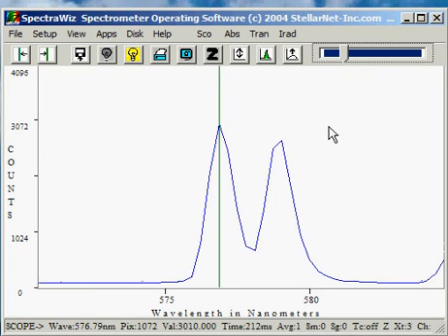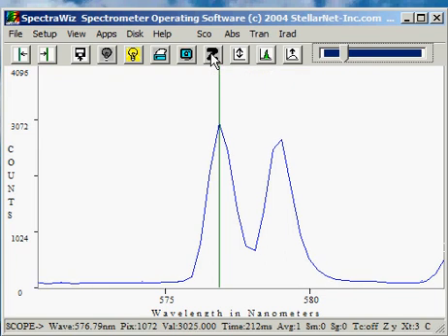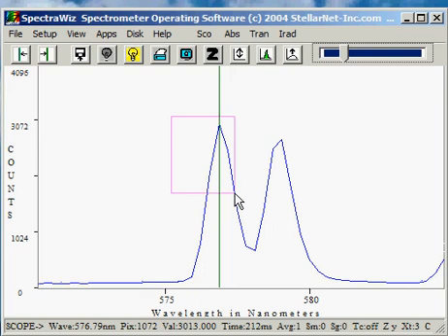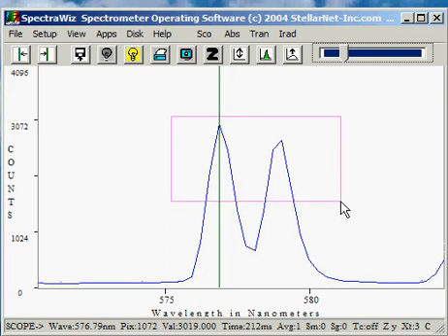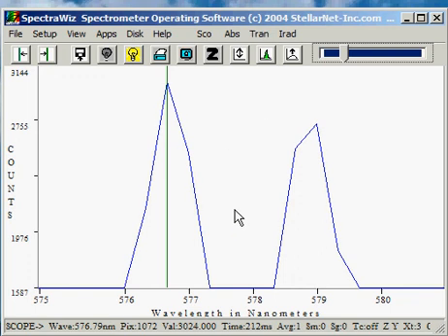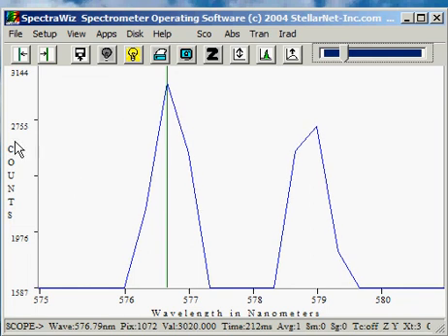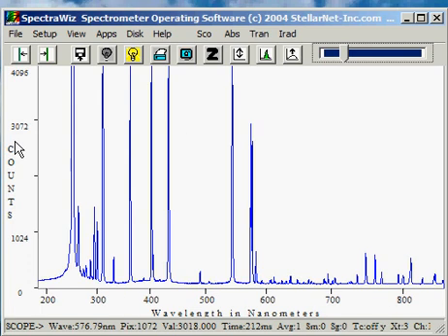Let's have a closer look at the zoom function. If I want to enable the YZoom feature, I right-click on the Z. This allows me to draw a box around the area that I only wish to see. And as you can see, the Y-axis is now offset by some value. To unzoom, I simply click to the left side of the graph.